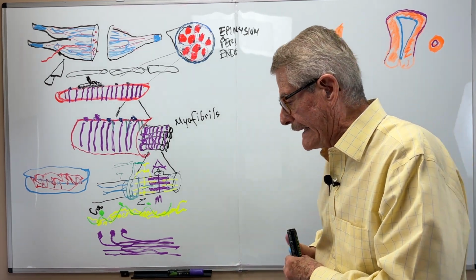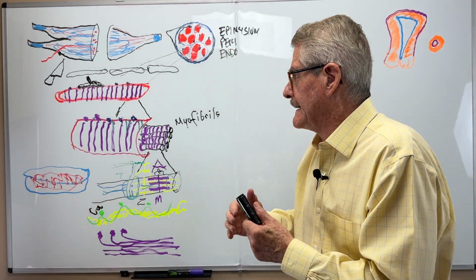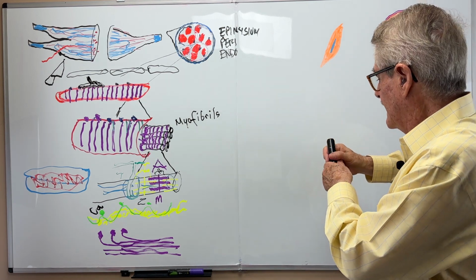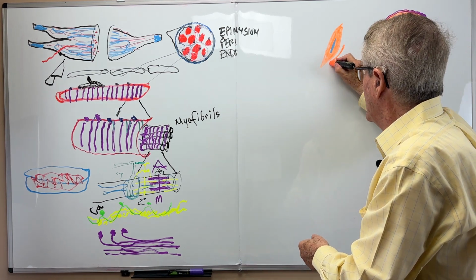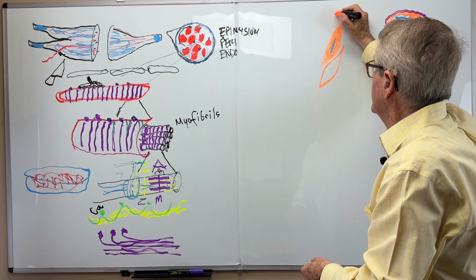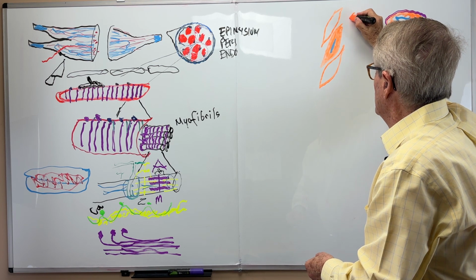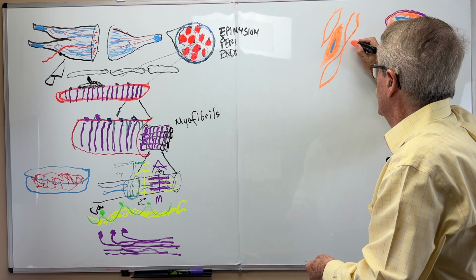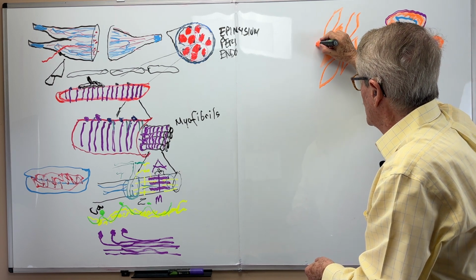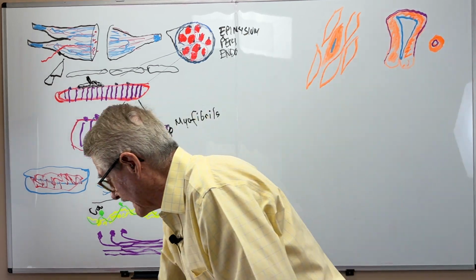And this cell will usually, obviously, it will not take the entire space, it's small, and it goes along with other cells, almost like a school of fish, like this, pretty much, trying to go to the thicker area with the other area.